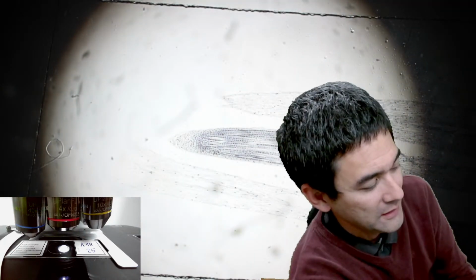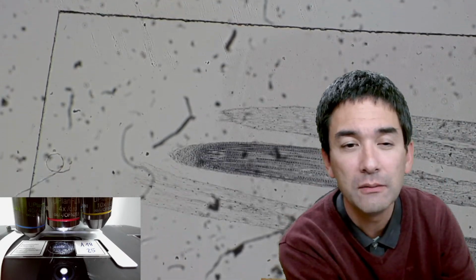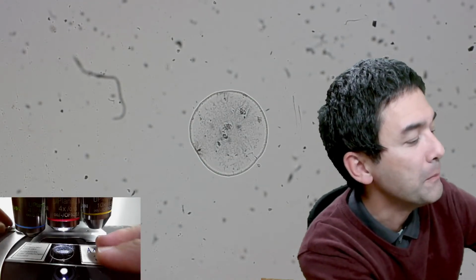Again, I did not have to make this slide. Ooh, look, it's very dusty, the slide. Actually, it's horribly dusty. I should have wiped it off a little bit. You know what? I'm going to try to wipe this a little bit. I don't know if this is going to help a lot, but this is almost embarrassing.